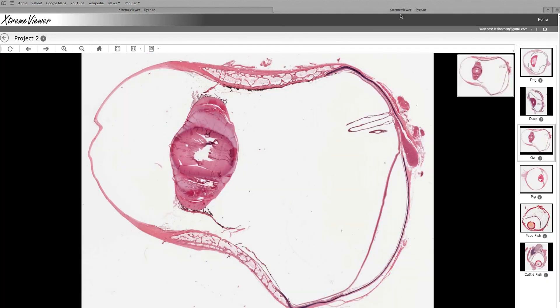I'll just show you some of the big picture changes you can see in some of the non-mammalian vertebrates. This is an owl eye. You can see they have a tubular-shaped eye, which is maintained by a large scleral ossicle. Scleral cartilage continues along the back, which gives this eye the rigidity to maintain its unique shape, which maximizes the amount of light that an owl gets to its retina. Another low magnification modification in birds is the presence of a pectinoculi, which is a pigmented vascular structure that extends into the vitreous.